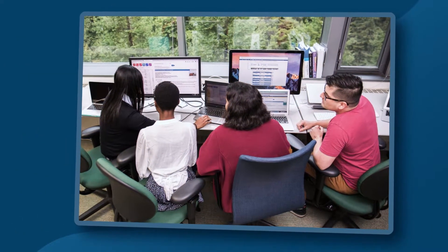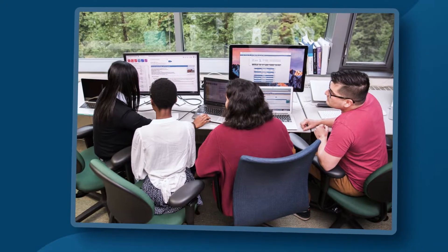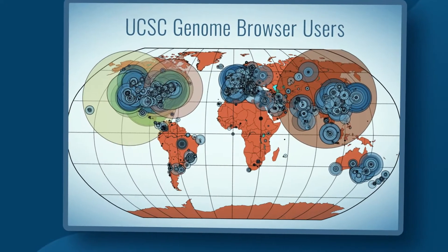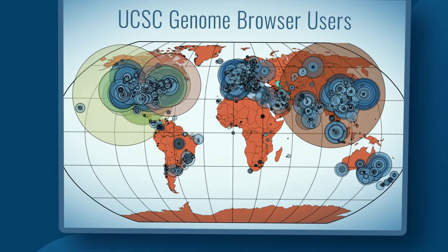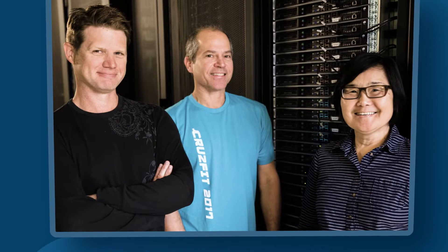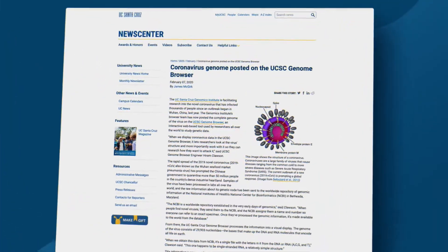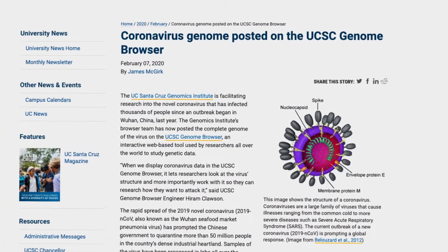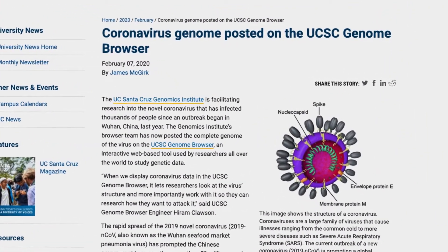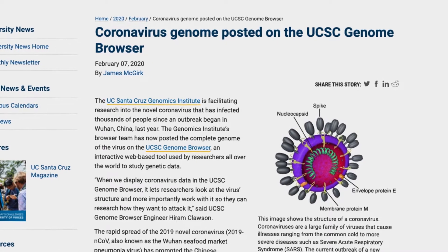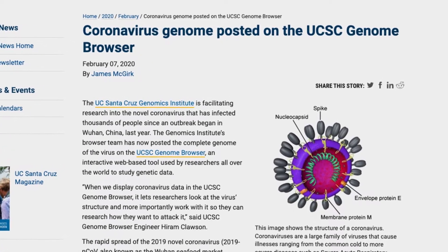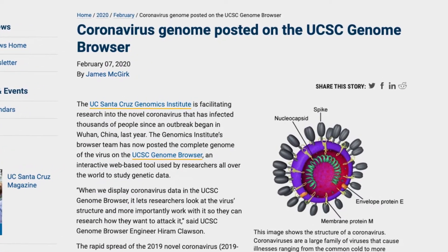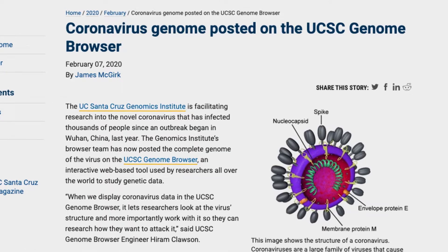The UCSC Genome Browser has been widely used by researchers worldwide for more than 20 years. The 2019 outbreak of the coronavirus inspired us to create the SARS-CoV-2 Genome Browser, extending the genome browser to SARS-CoV-2 data for use by those wishing to understand the biology, epidemiology, and immunology of the virus.